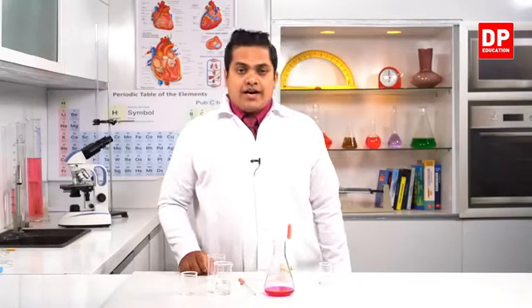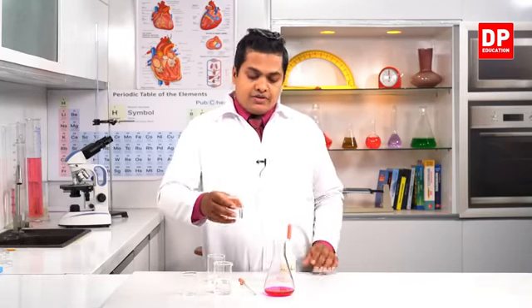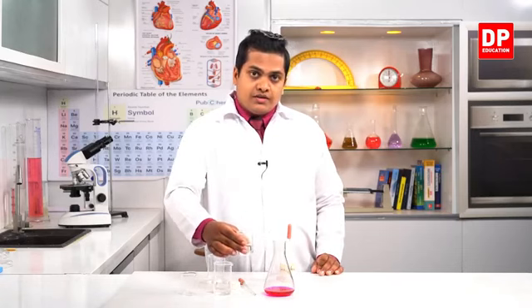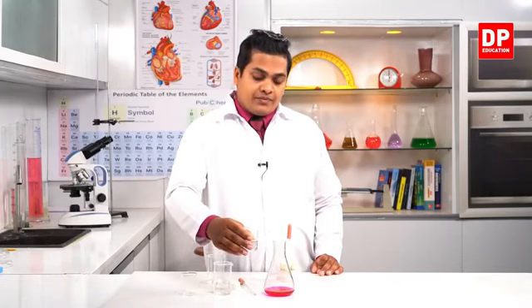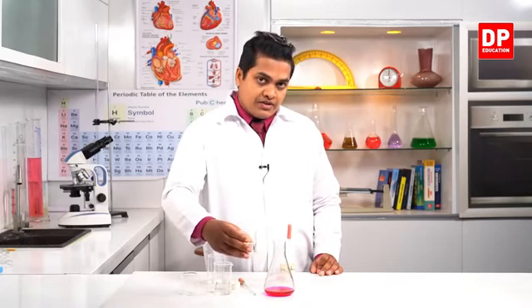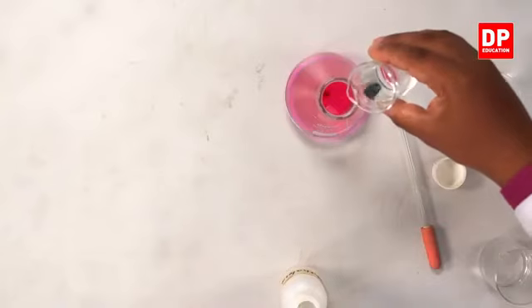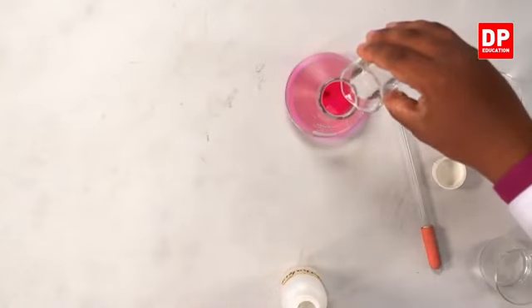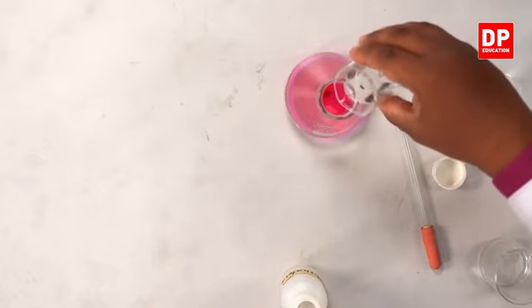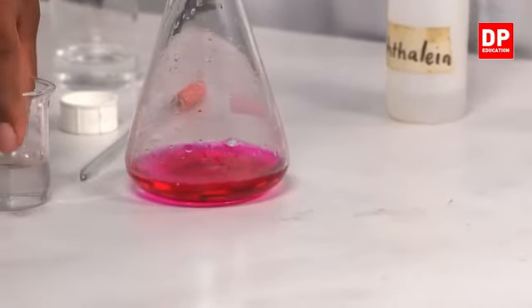Now I am about to add the previously measured hydrochloric acid to this solution of sodium hydroxide. Observe what happens when I pour this liquid into the vessel. This liquid is hydrochloric acid, HCl. We'll add very gently. Right. So we'll mix it.